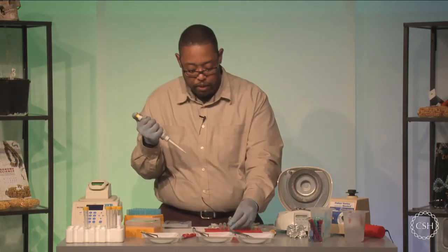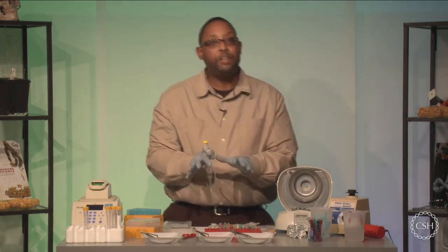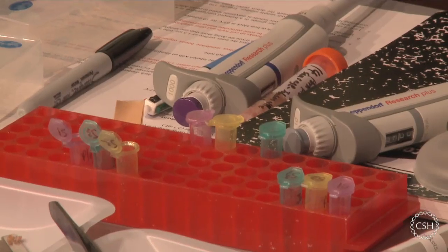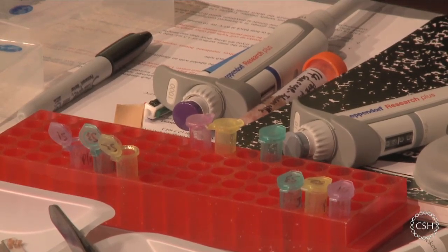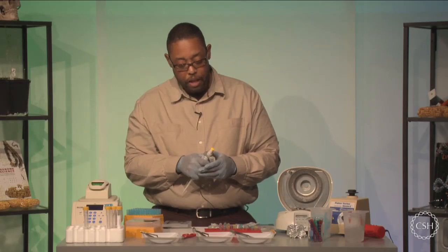So I've removed the last bit of wash buffer from my last test tube. And at this point, you can allow them to sit to dry for about that 2 to 3 minutes, which will allow most of the alcohol to evaporate off. Okay? At that time, you can then move to eluting the DNA off of the silica resin.